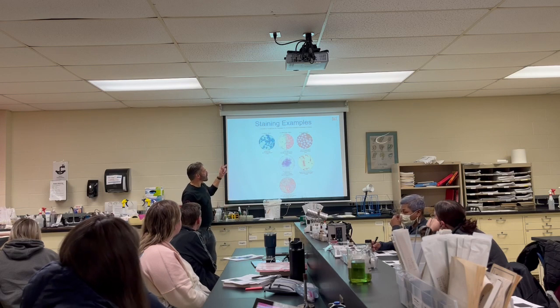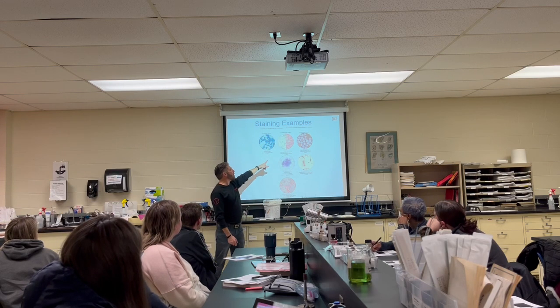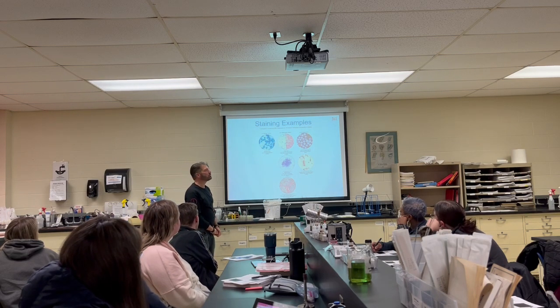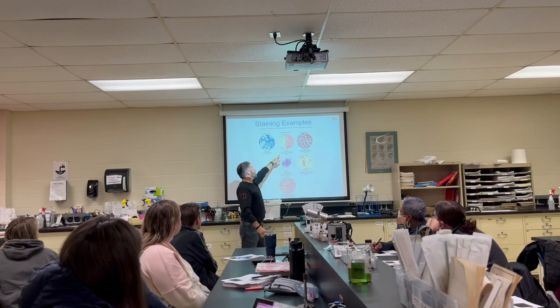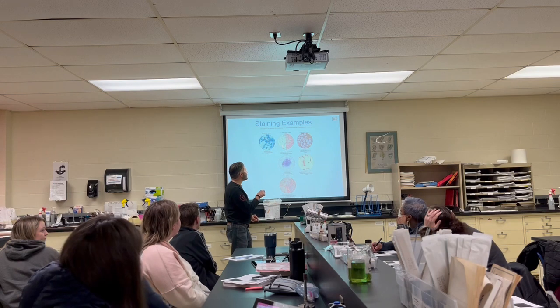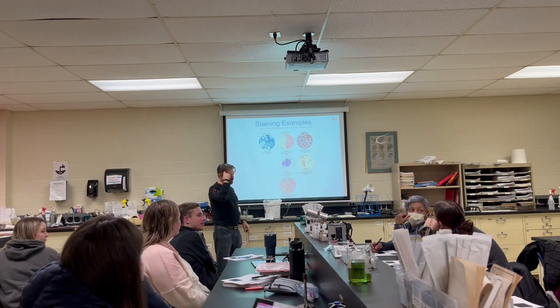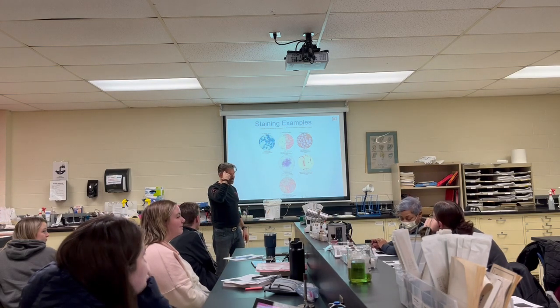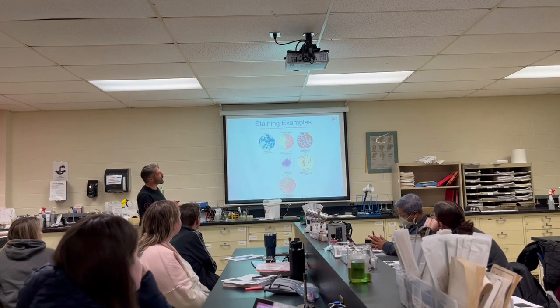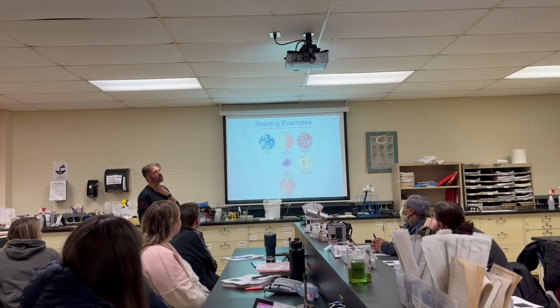All right, so on this slide here, can you all agree that on the left half it's purple? Bluish purple? It's yellow. All right, we'll do this though. The bacteria. I can't see that far away, but I'm for it. I can help you out. Yeah, correct it. Sure. So those are gram positive. So we can all agree that that is purple.